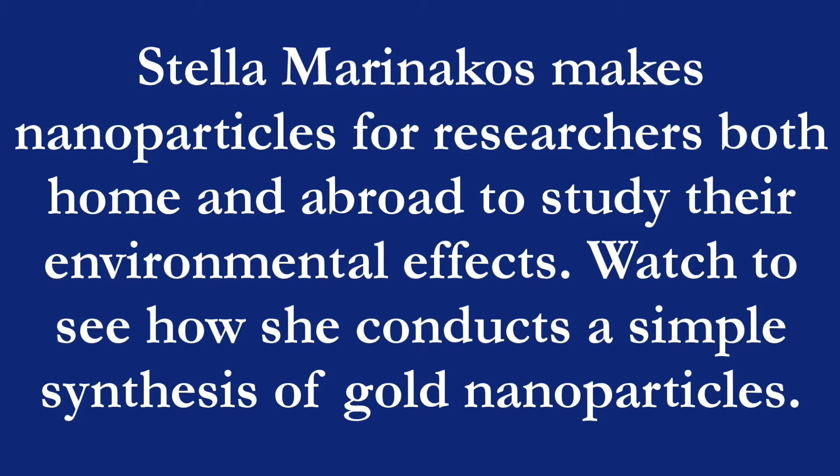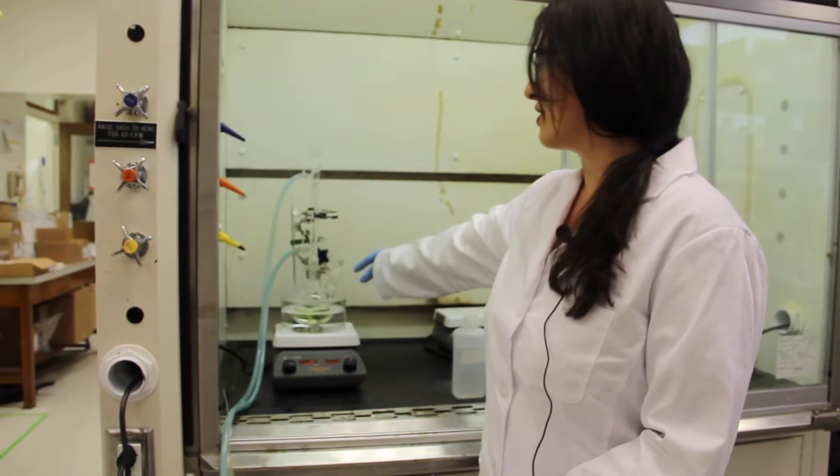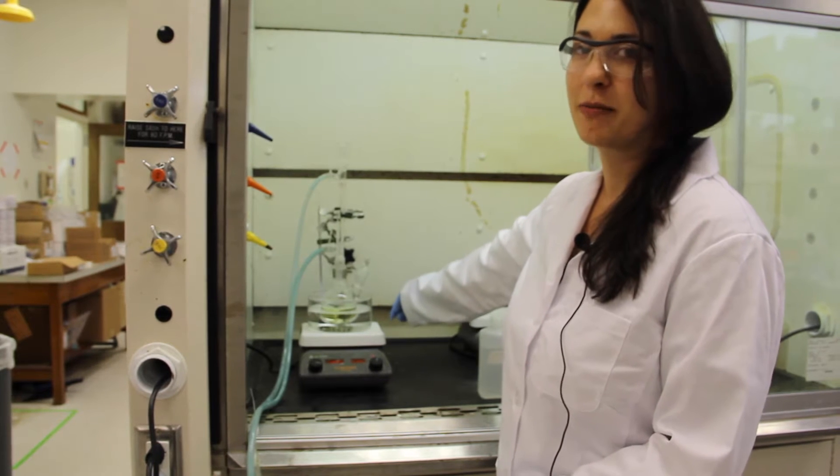This is Duke University. Today we're going to be making gold nanoparticles. Here we have our gold salt solution dissolved in water and it's stirring on a hot plate.